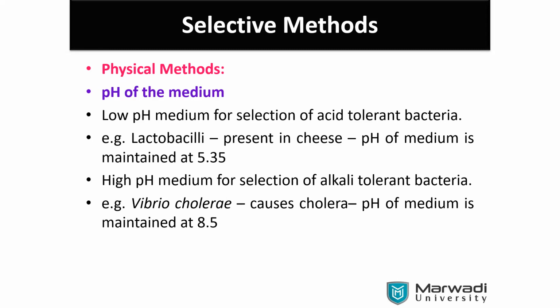So how to prepare such a medium, we also have to learn. When we are preparing nutrient broth, we have to adjust the pH. While adjusting the pH, another problem may start. Maybe in some chemistry experiment, in acidic conditions something starts to precipitate. If you have prepared the nutrient media in broth and added some acid, how can we create the pH balance? How are you maintaining pH, with any buffers? Can you manage the pH?